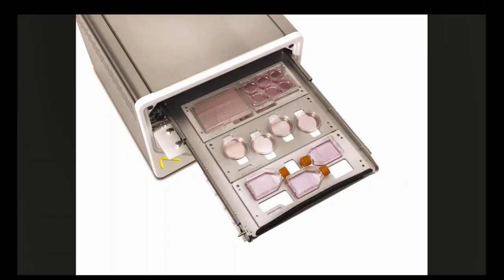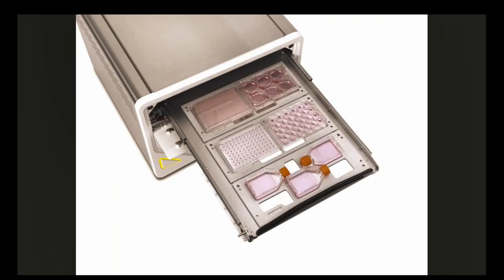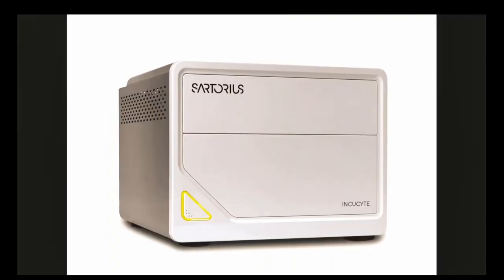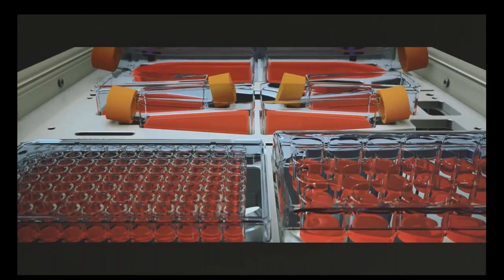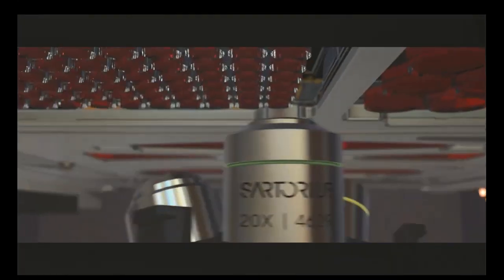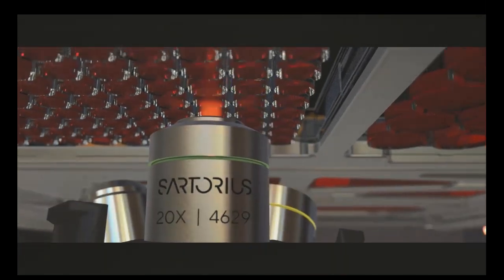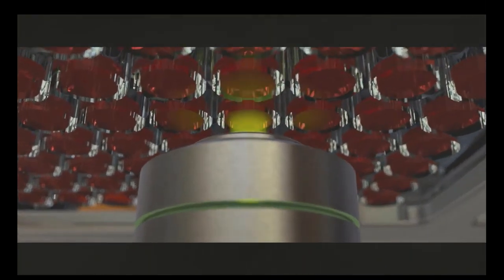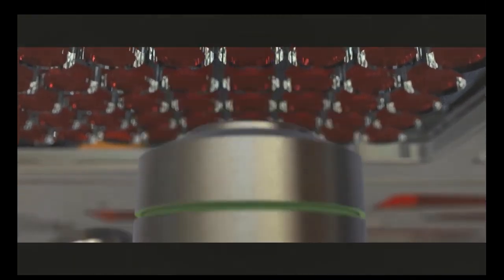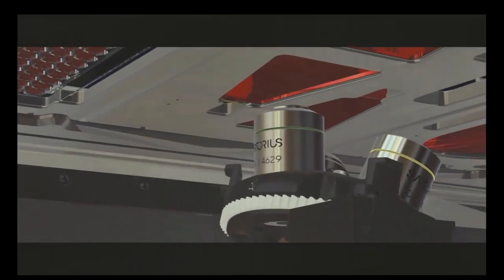So the Incucyte can image up to six 384-well plates in parallel, and this offers a high throughput in a live cell imaging context, but it also supports a large number of dishes and flasks. Then, if we have a look at the cells inside of the Incucyte, the plates actually remain stationary, and the only moving part is, in fact, the camera on the bottom, where it acquires images from location to location. The images are acquired in the HD phase channel and then in fluorescent channels.